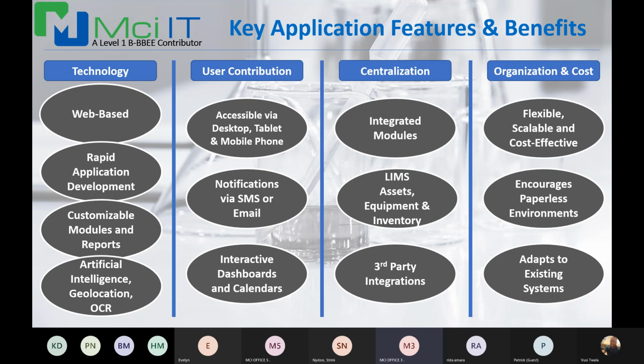Because it's web-based, it's accessible via desktop, tablet, and mobile phone. It has robust modules for notifications via SMS or emails, and then to make it easy on the user, it has interactive dashboards and calendars as well.